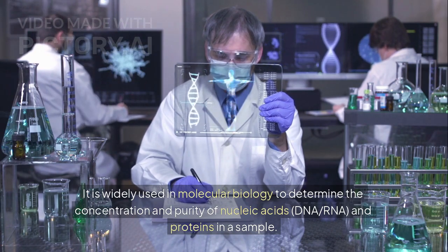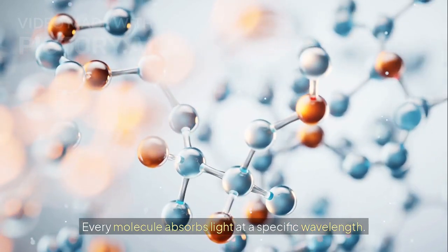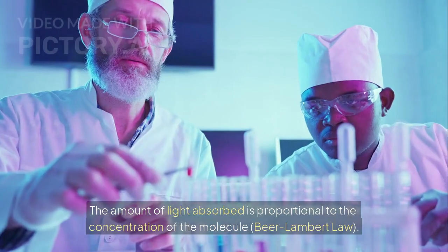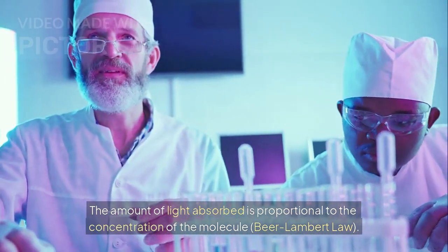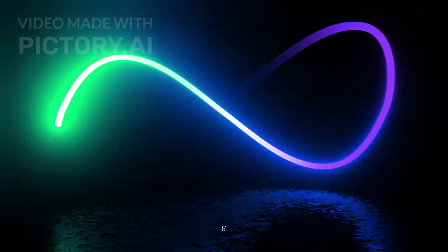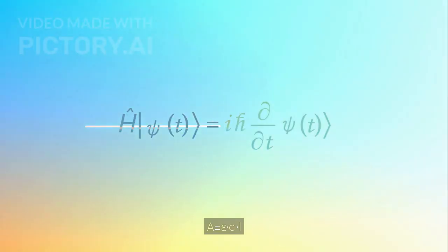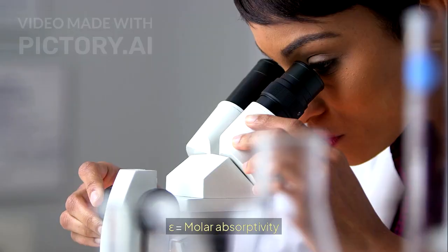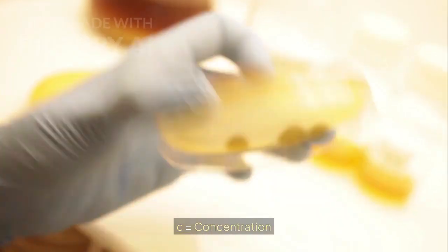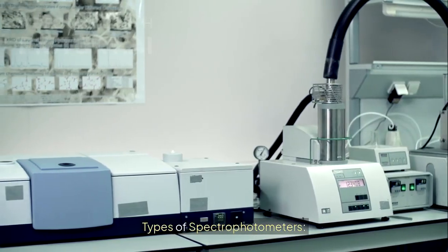in a sample. Basic principle: every molecule absorbs light at a specific wavelength. The amount of light absorbed is proportional to the concentration of the molecule. Beer-Lambert law: A = ε · C · L, where A equals absorbance, ε equals molar absorptivity, C equals concentration, L equals path length.